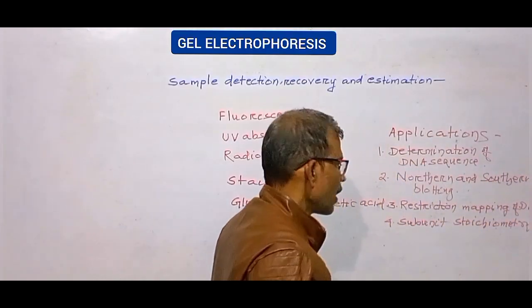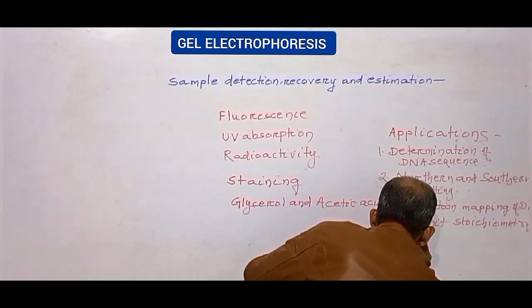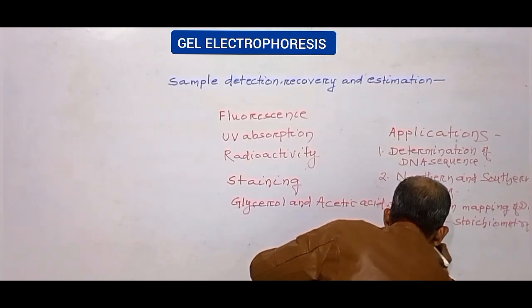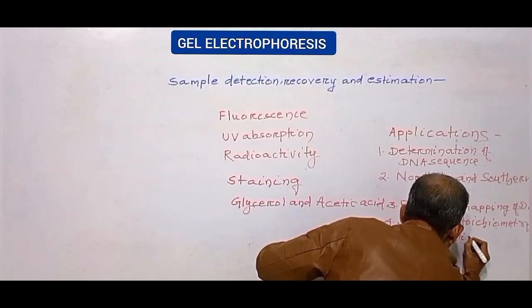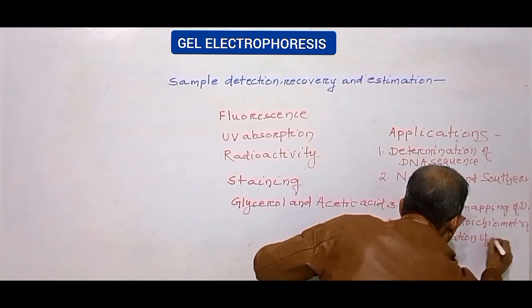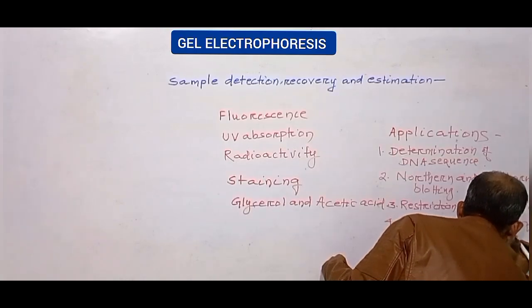And finally, determination of molecular weights of different proteins.